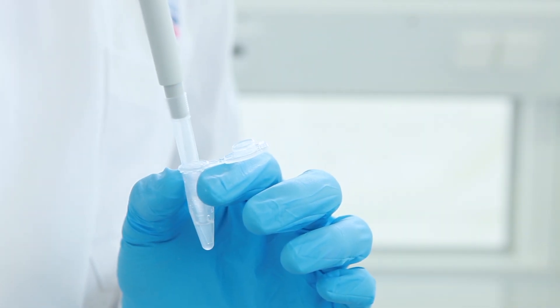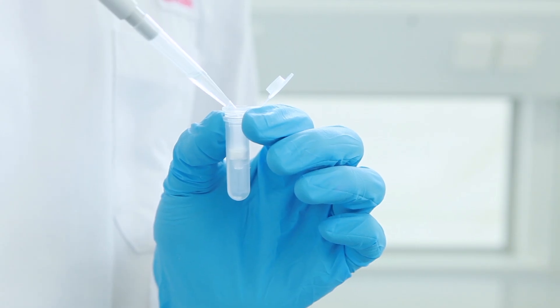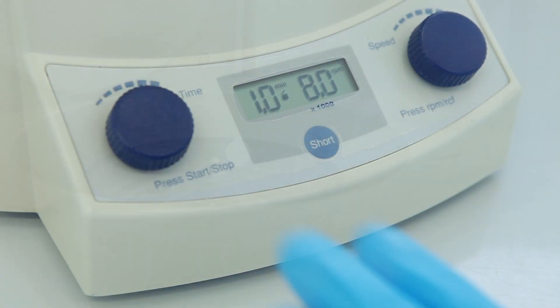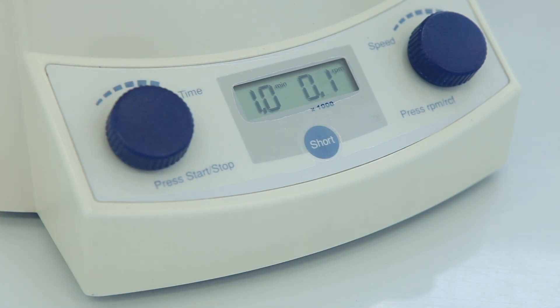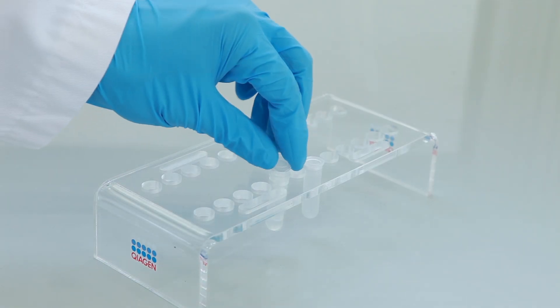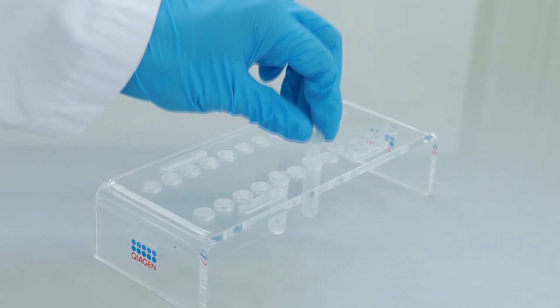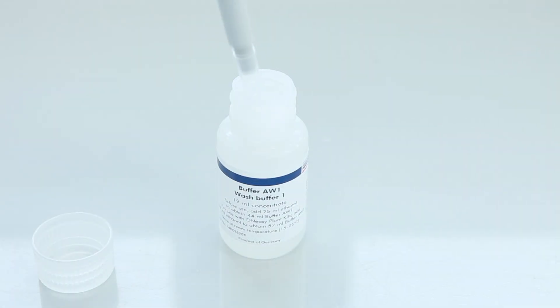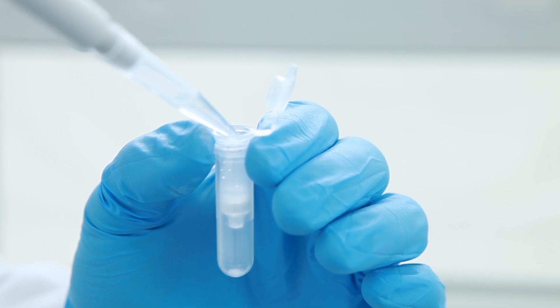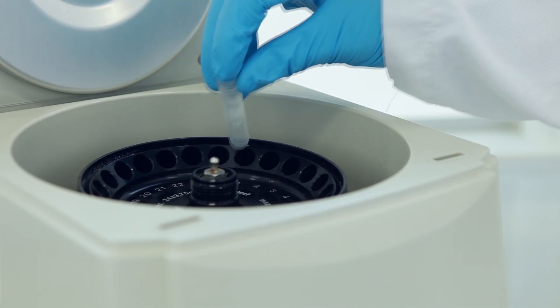Pipette the mixture into a DNeasy spin column. Centrifuge for one minute. Discard the flow-through and collection tube. Place the spin column into a new collection tube. Add 500 microliters of buffer AW1. Centrifuge for one minute.